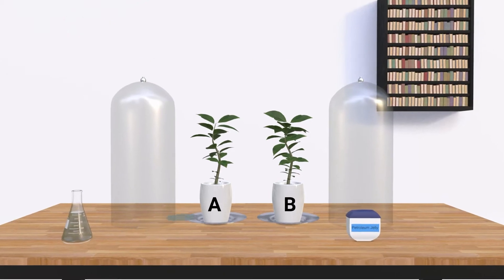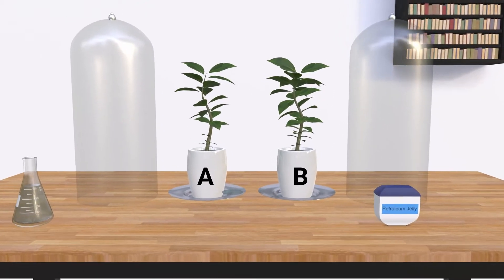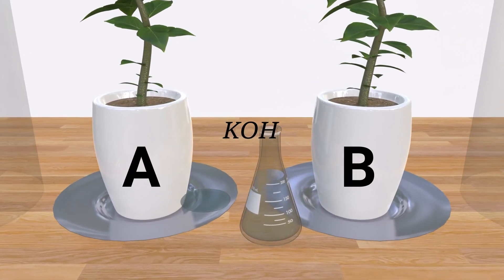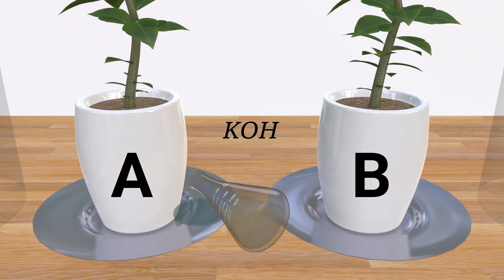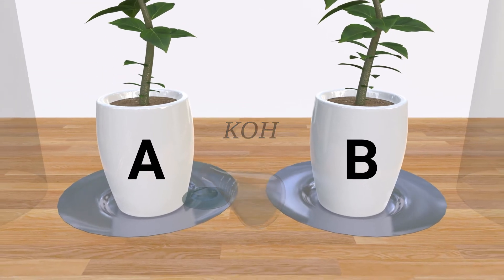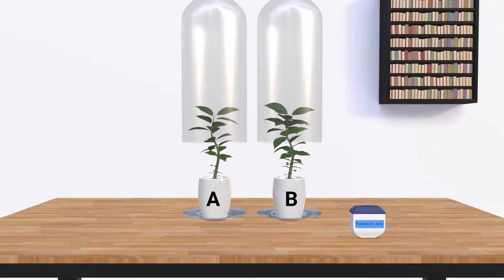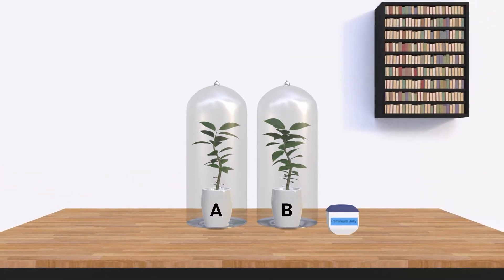After three days, place a watch glass on the glass plate of plant A and add potassium hydroxide, which has the property to absorb carbon dioxide. Cover both plants with separate glass jars and use petroleum jelly to seal the bottom of the jar to make it airtight.